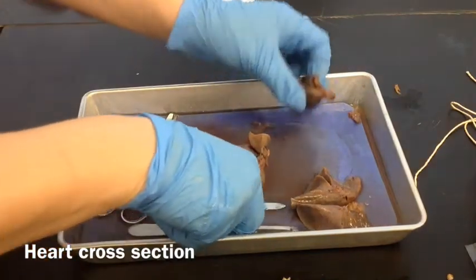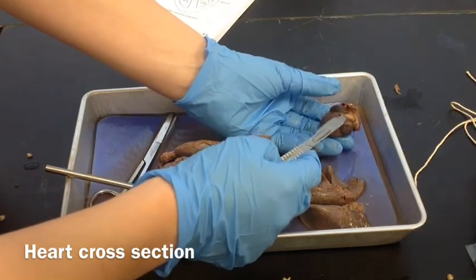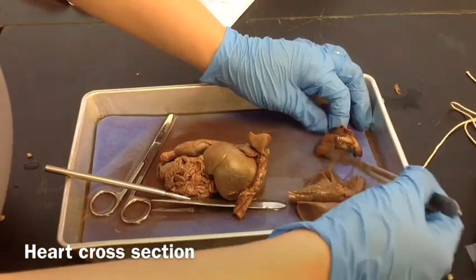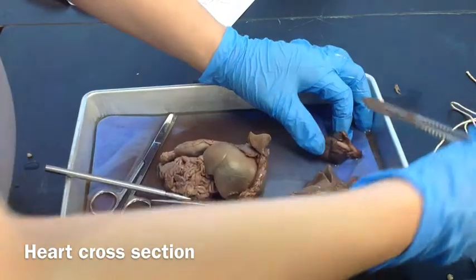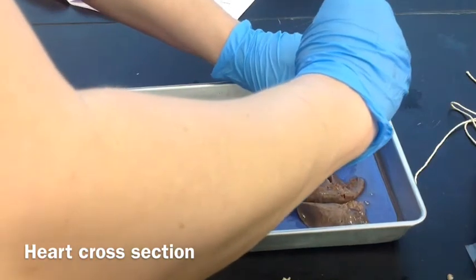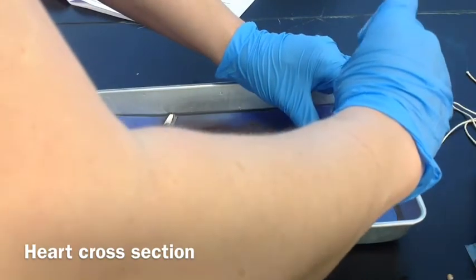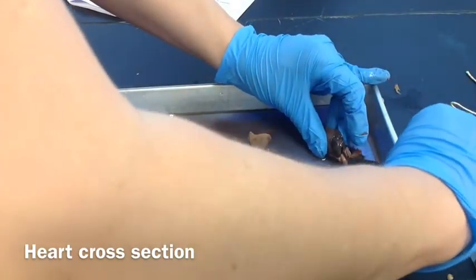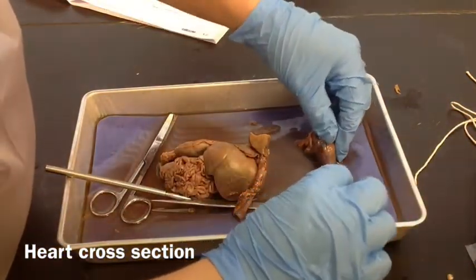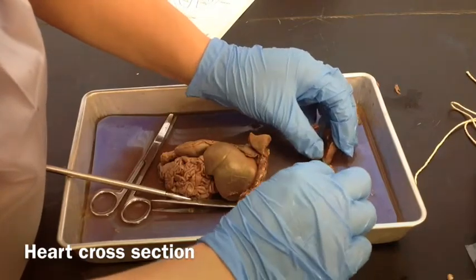The next thing we're going to do is cut the heart in half. Orient it so that you see the front of the heart with the atria and the aorta and all of that. We're going to slice through it from the anterior to the posterior — we want to cut longitudinally this way. I'm going to turn it on its side and cut. You want to make cuts as smooth as possible, because if you saw into it, it's going to butcher it all up inside and you won't be able to see very much. One smooth cut if you can.